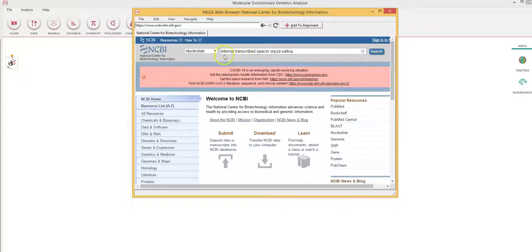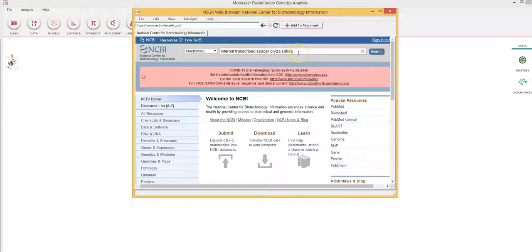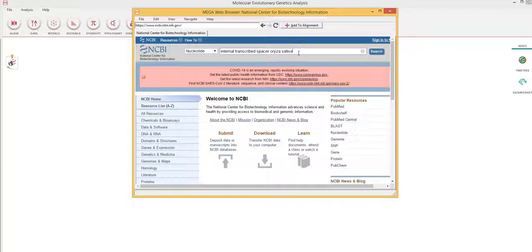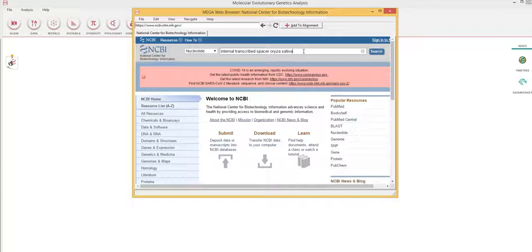So I'm looking for internal transcribed spacer of Oryza sativa and I want to utilize this particular sequence to construct a phylogenetic tree based on the internal transcribed spacer of rice. So I search.